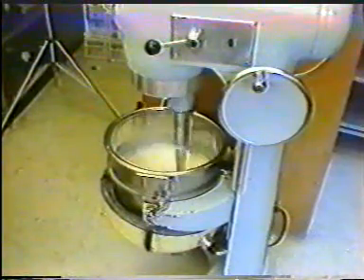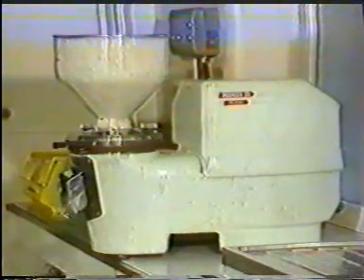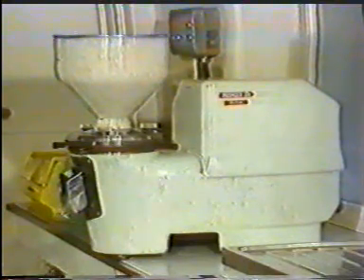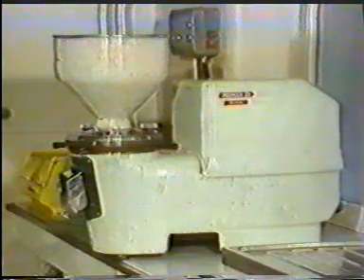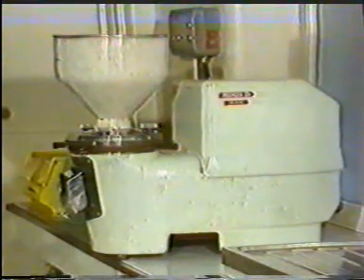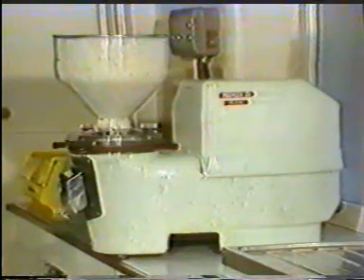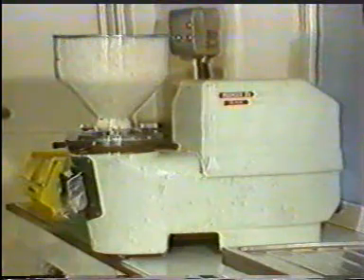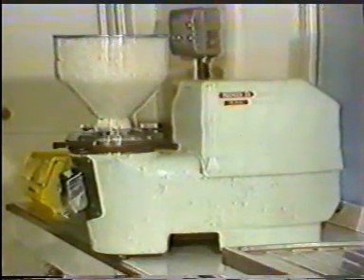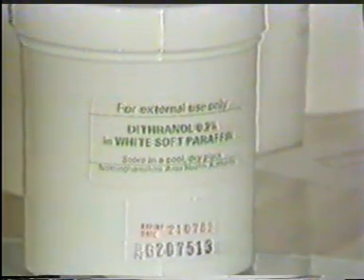A further process called milling may be necessary to obtain a smooth, homogeneous product. The product is forced between 2 abrasive stones, one stationary, one rotating, the gap between them being adjustable. The particle size of the solids is reduced, thus achieving a better dispersal throughout the product. This process may be used for preparations containing substances such as dithranol or coal tar.